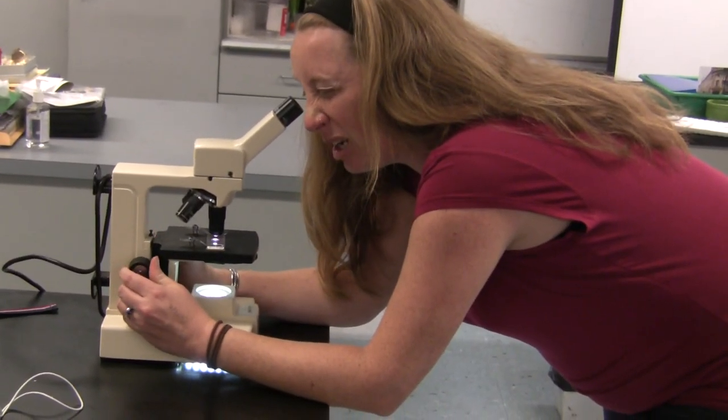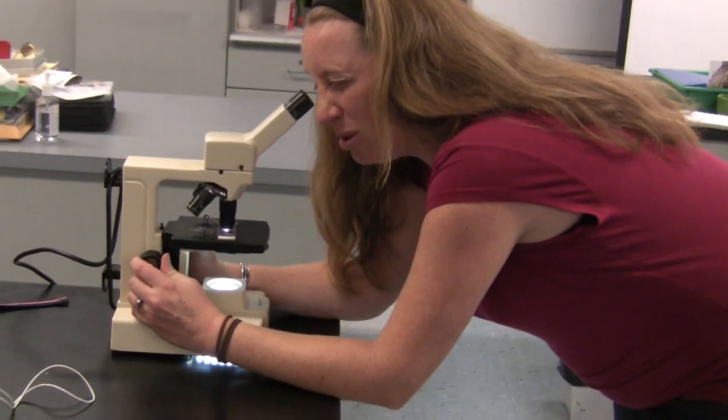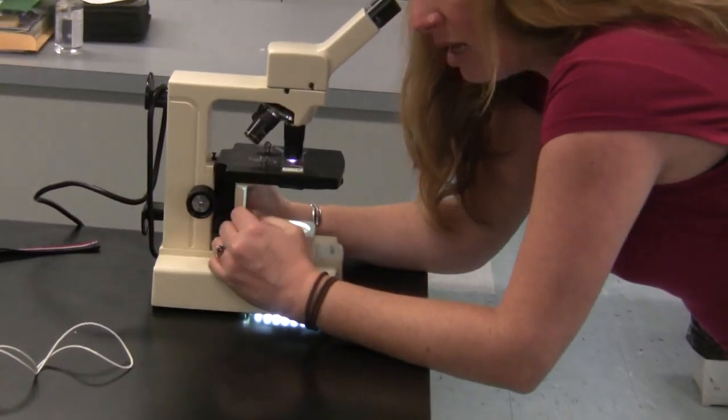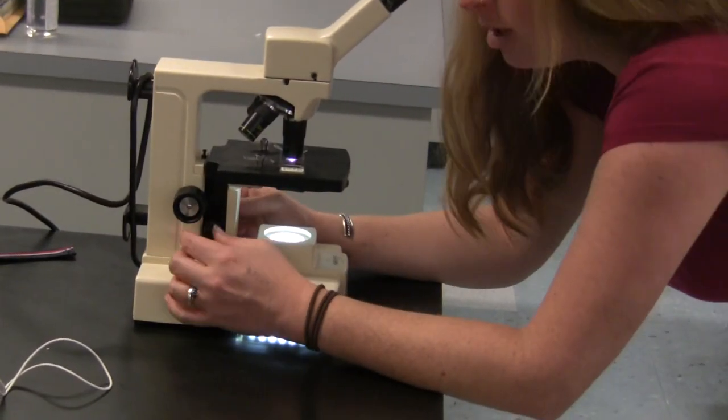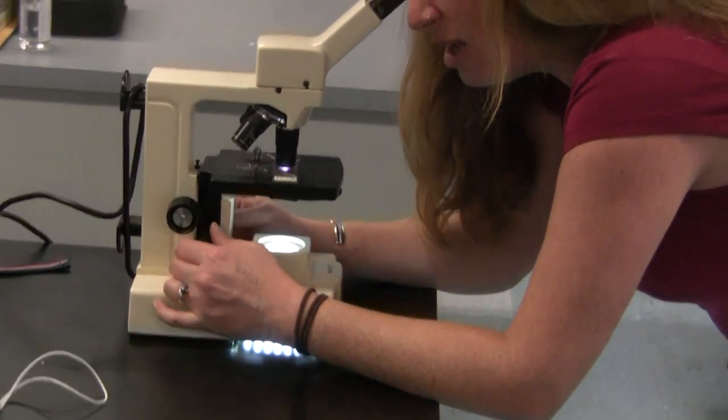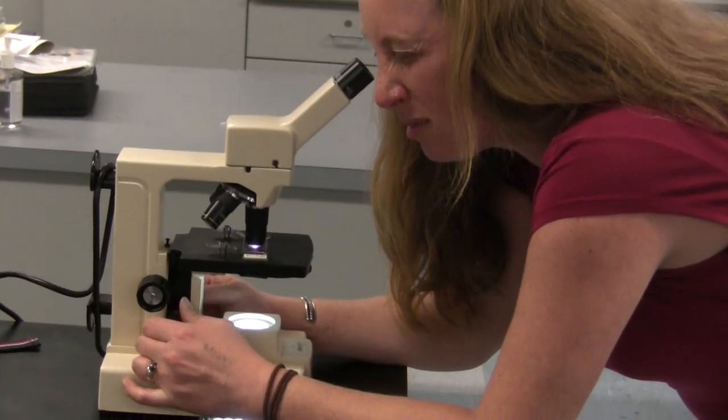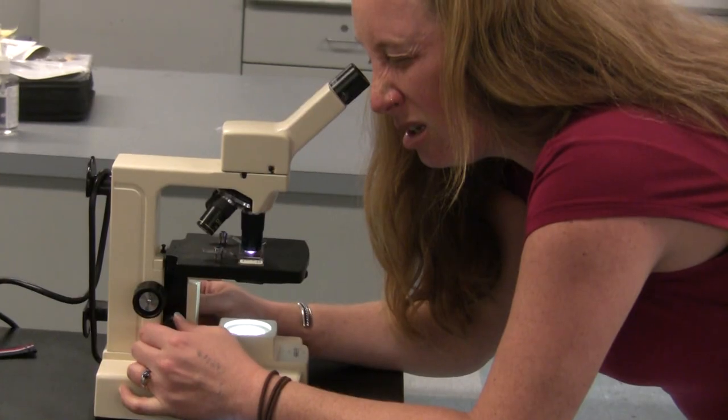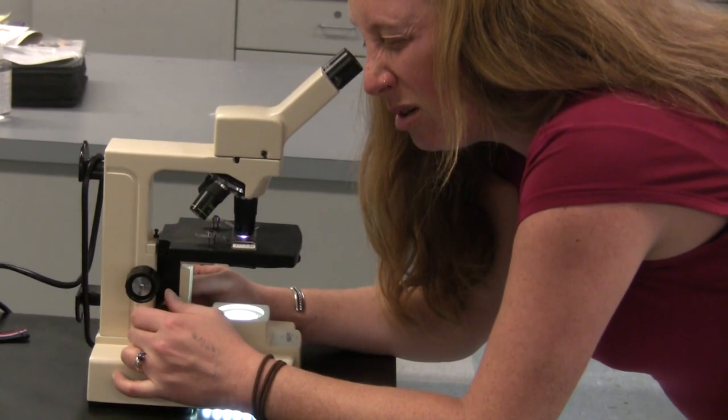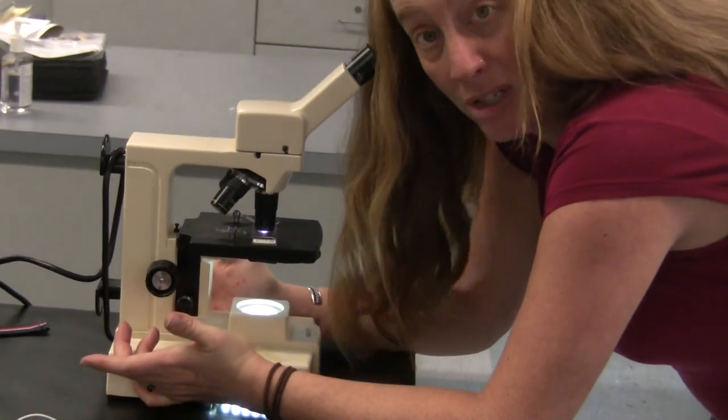You're looking through, you're bringing the stage up using the coarse adjustment knob. And if you can't see it too well, try the fine adjustment knob and bring that up until voila, you can see what you want to see.